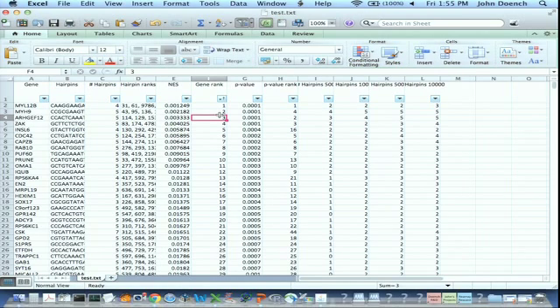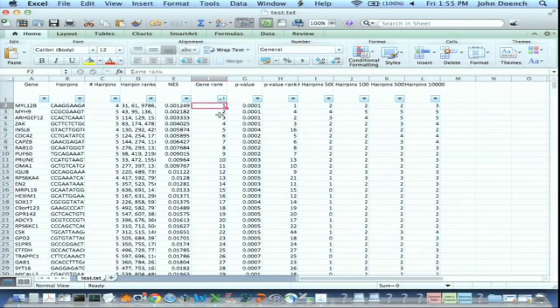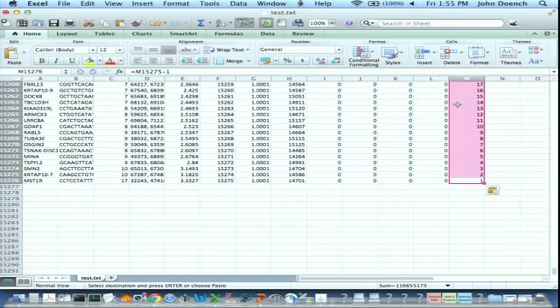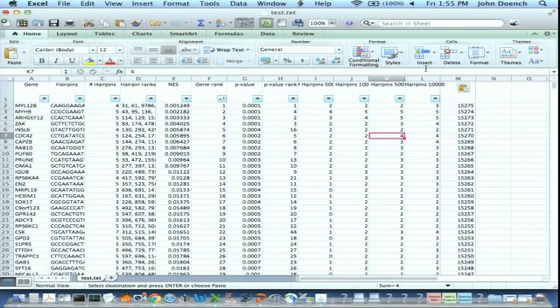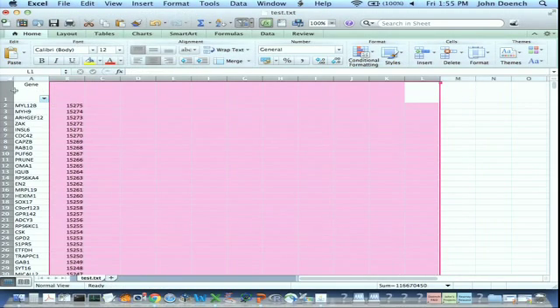One way of doing it is just to rank in the opposite. So here there are, let's see, how many, 15,275. So 15,275, and we'll do -1. And copy that all the way down. There are certainly more sophisticated ways of doing it. Just for the purposes of demonstration, we'll stay with this means of doing it. Okay, so also the input can only have two things, gene symbol and number, and that's it. So we'll delete everything else. We also need to delete our headers.